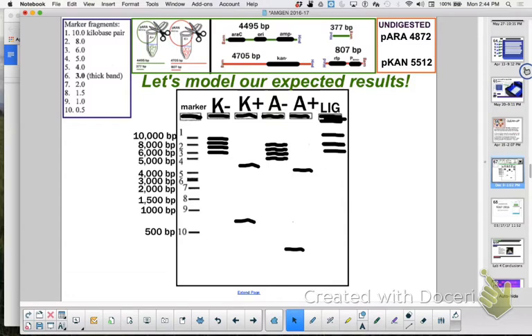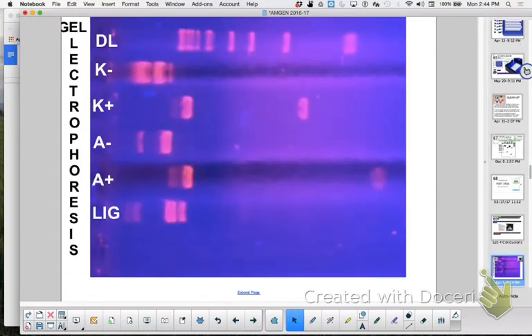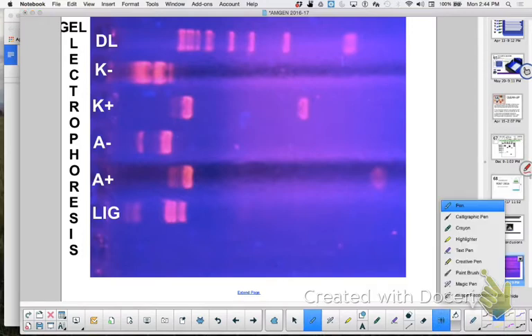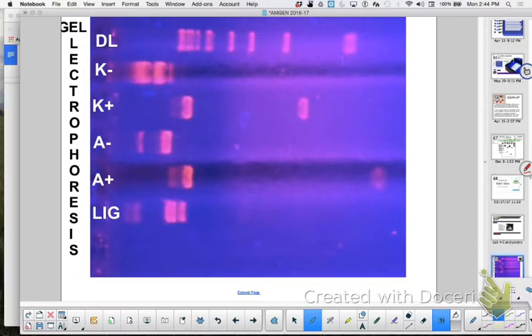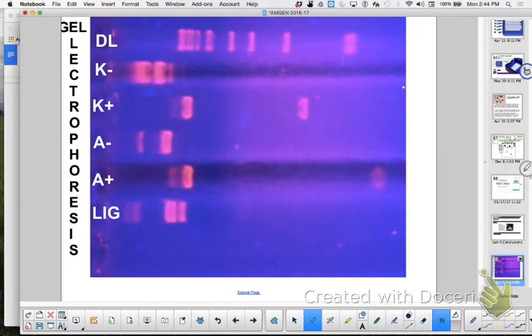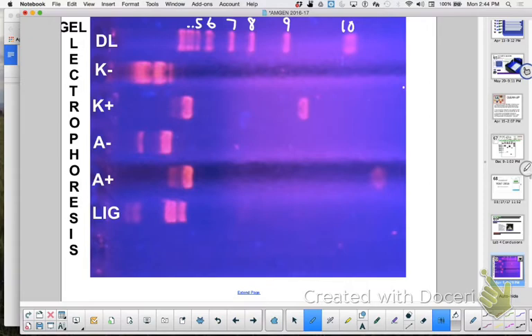So those are my predictions. When you look at your actual picture, you're going to look, does it match that? So the first thing I'm looking at is I'm looking at my marker. And when I look at my marker, this marker that's way out here, this is probably marker number what? 10. Then this one is 9, 8, 7, 6, 5, 4, 3, 2, 1. You okay with that?